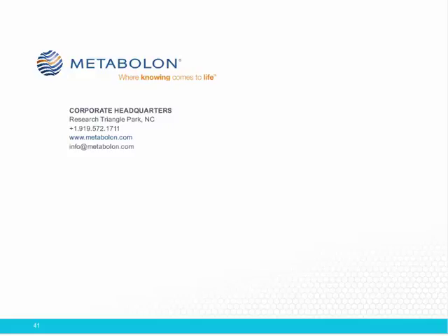All right, perfect. We got a question fairly early on during Robin Parham's presentation. Karen asks, what do you mean by a large number of samples? Could you clarify? Yeah, so I mentioned that we ran a study with over 12,000 samples. Really, that's dependent on the assay and the run length. Typically, we keep our run lengths less than 5 minutes if possible in our group. The key here is that we're flexible and we just need to have a conversation, really. Okay, perfect. Sounds pretty straightforward.